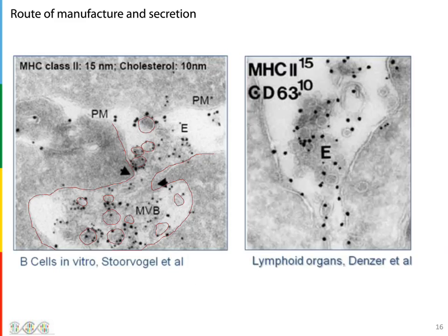But these sections have been stained with immunogold conjugated antibodies. And if you look where that intensely dark black spot actually is, you'll see on the plasma membrane of the adjacent cell, there's very little staining present. And in fact, even on the limiting membrane of the endosome, which gives rise to these vesicles, there's still actually quite scant staining. The staining is absolutely focused to these discrete small vesicular structures.